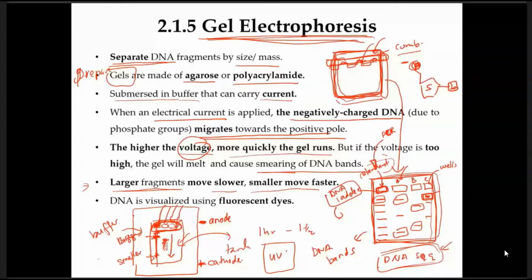Okay, so sebelum awak boleh masuk ke dalam mesin yang observe under UV light, you have to dye your gel using dye lah kan, so that the dye can dye the DNA fragment. You cannot observe the DNA pattern, the DNA band using your naked eyes.